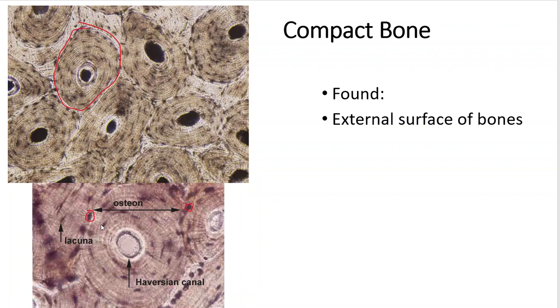They're sitting in lacunae right there. You mean that's not a cell? That's not a cell. That's actually a whole central canal. We'll get to that later. But as far as identifying these, they are so easy. I mean, seriously, you cannot miss them.